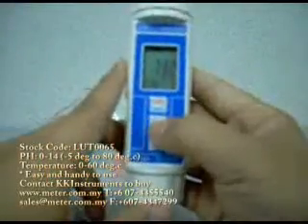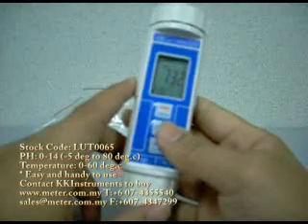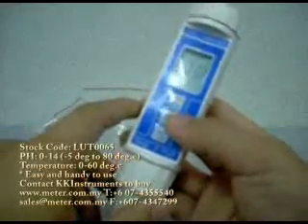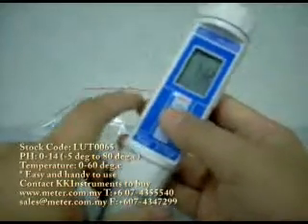If you need to hold a reading, you can press this button by holding it. This is for easy recording, especially when you are not able to see the reading and make the recording at the same time. This hold button will help you a lot.